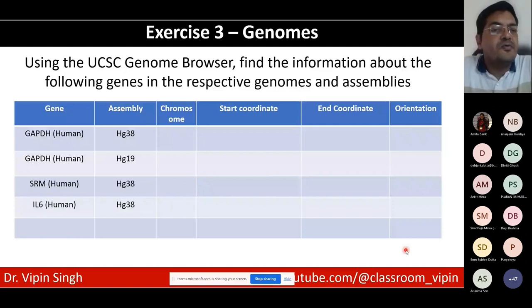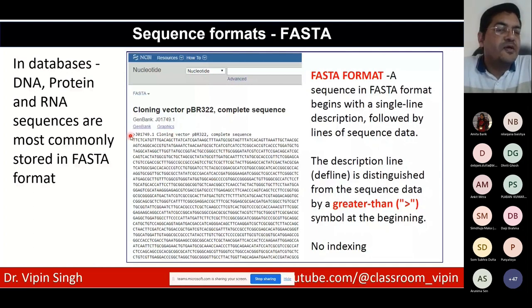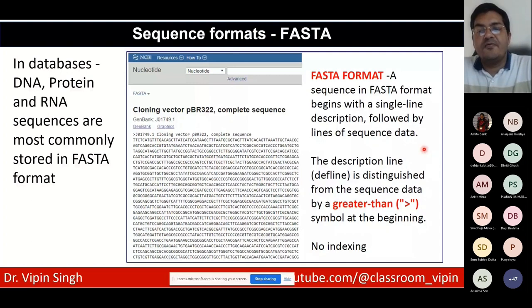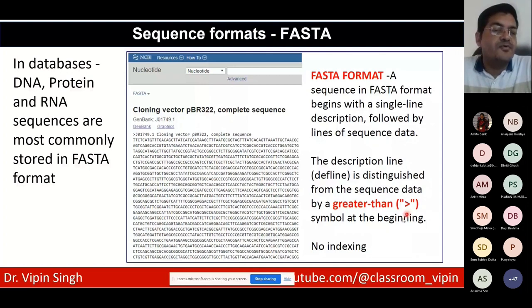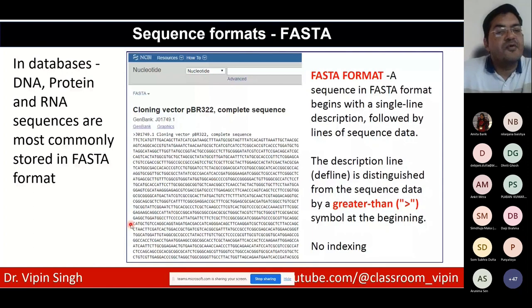The FASTA definition line generally contains the accession number followed by a short annotation describing what the sequence represents. The description line is distinguished from the sequence data by a greater-than sign at the beginning, with no indexing or numbering of the sequence. DNA, protein, and RNA sequences are most commonly found in FASTA format.